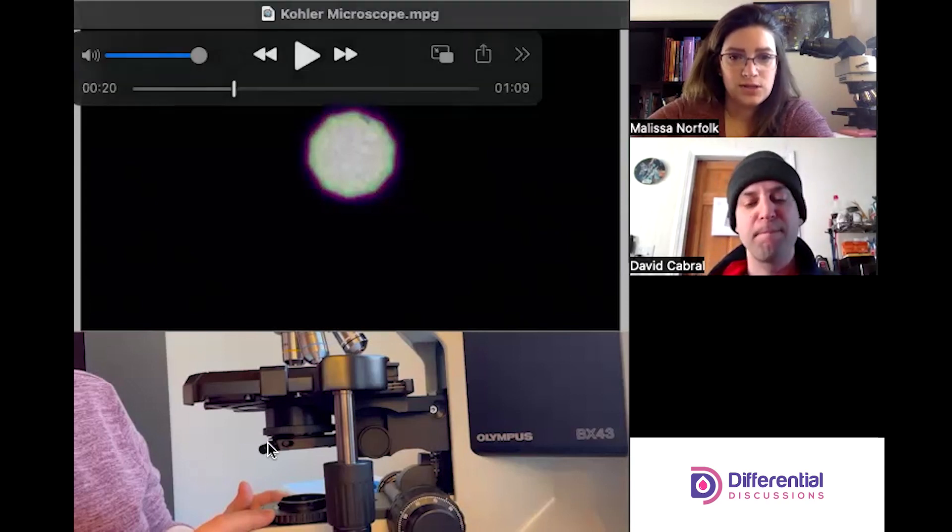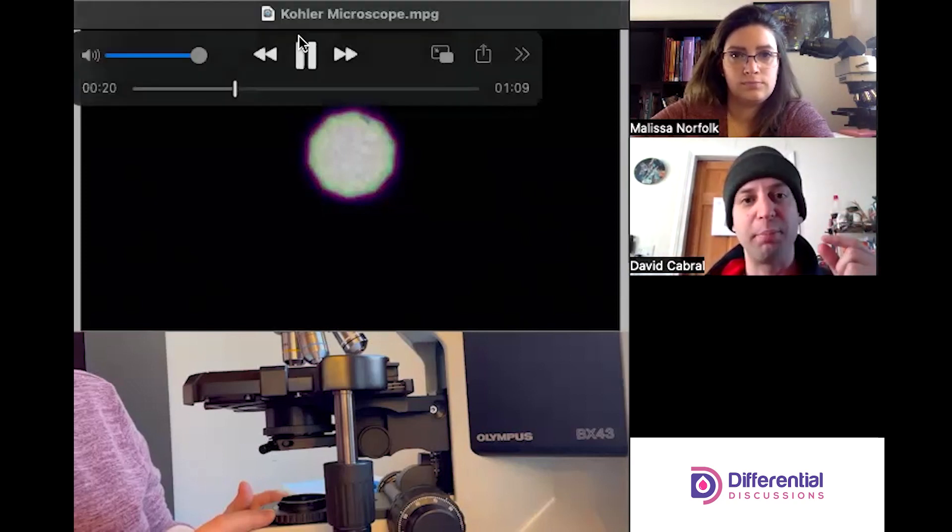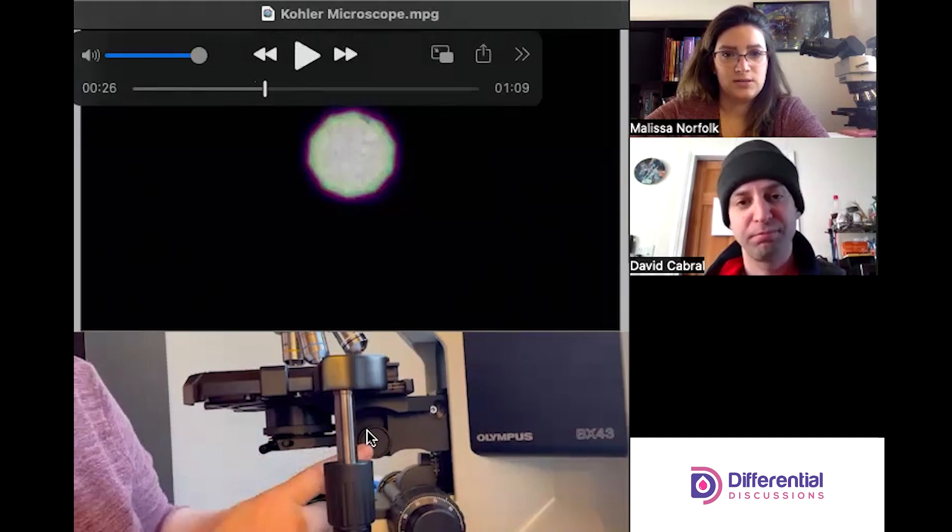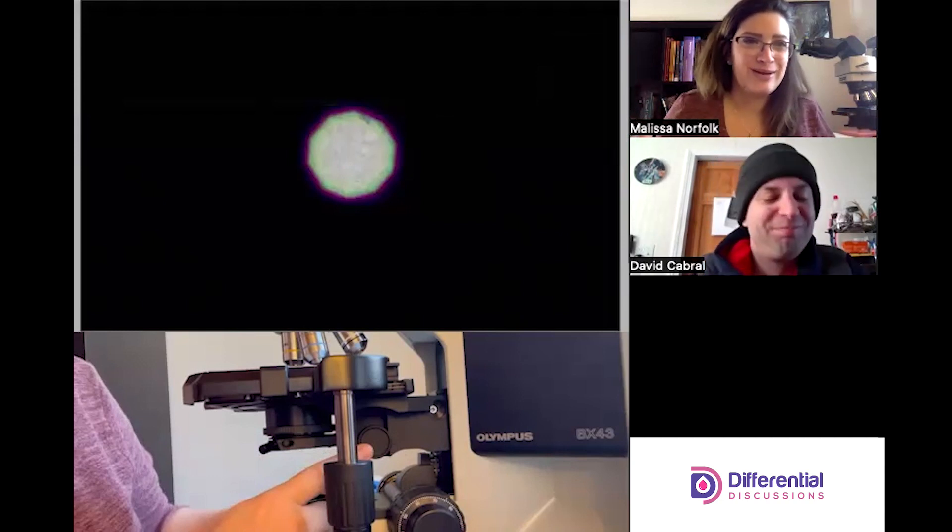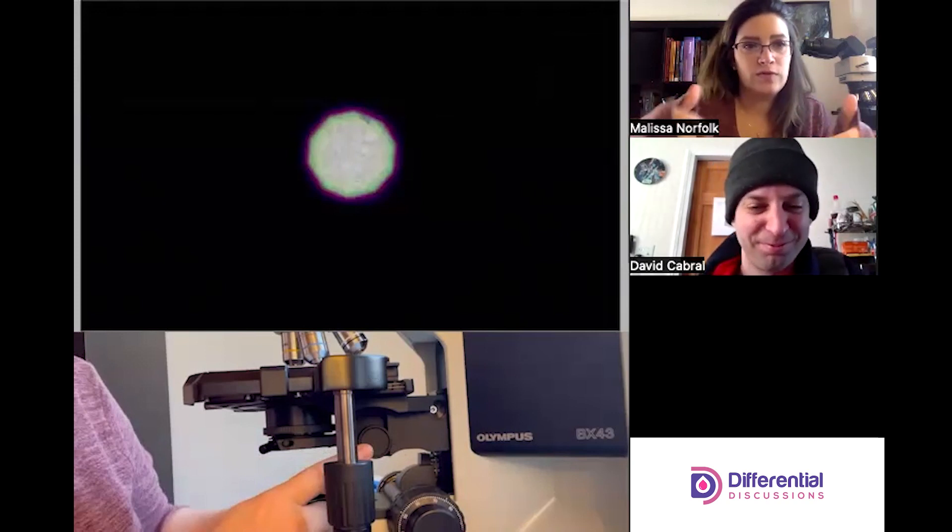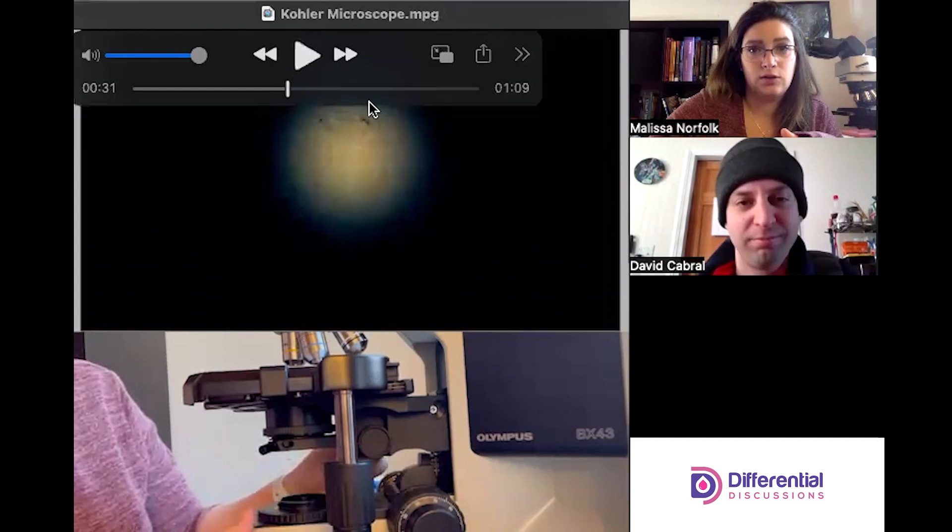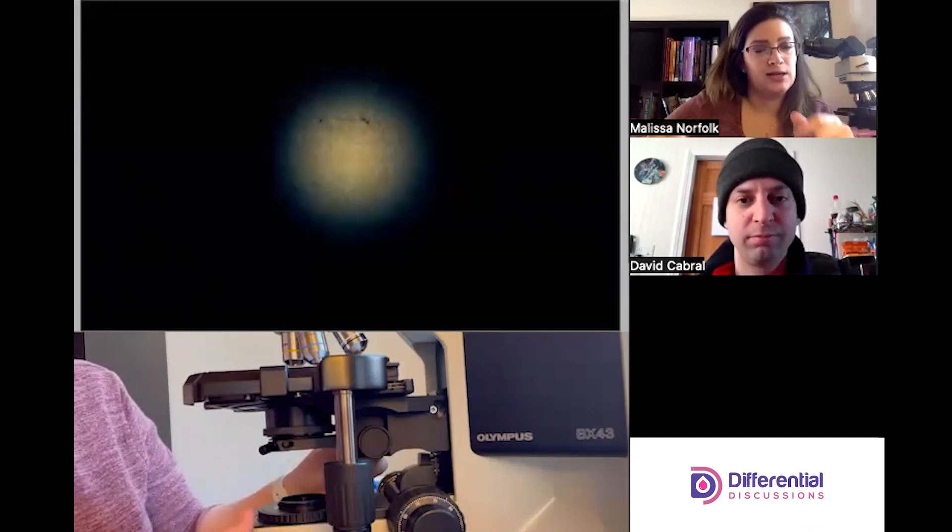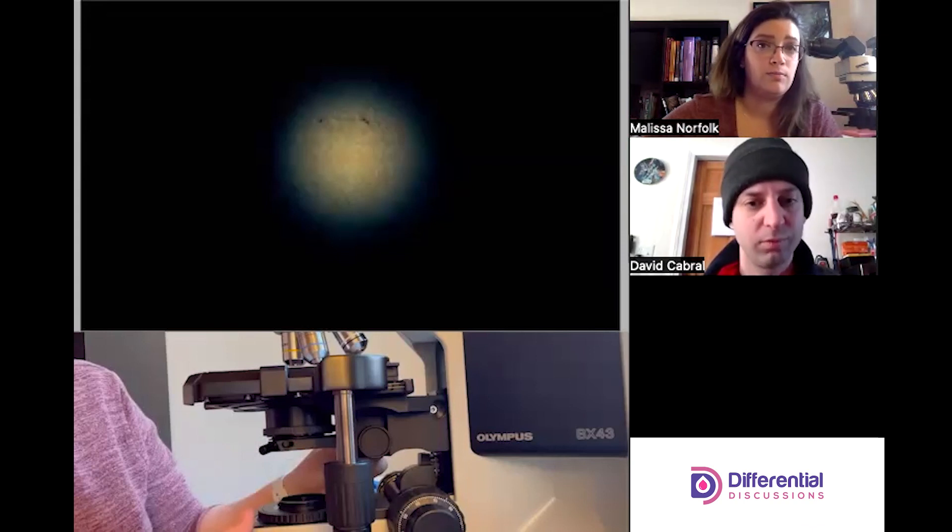If you're not seeing the well-defined edges of the shape, you're going to need to adjust the position of the condenser—it might need to come down a little bit to come in clearer focus. You can see here I'm playing with the condenser knob, and I'm going to move the condenser up and down. My Kohler is set and it doesn't change because I'm the only one that touches my microscope, so I'm going to now move the condenser up and down so that you can see what it looks like. If you go in and it looks like this where it's a blurry image and you can't see the geometric shape with sharp clear edges, then you have to keep adjusting that condenser up or down until you get it in nice defined edges, because that is how you're going to know that your condenser is set to the correct place on your microscope.